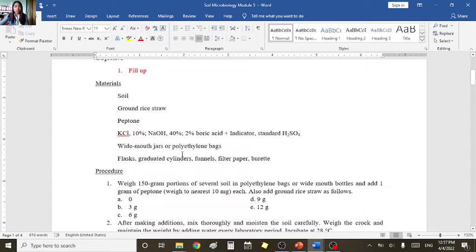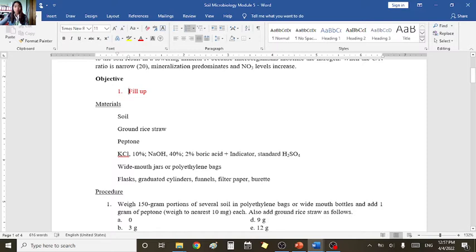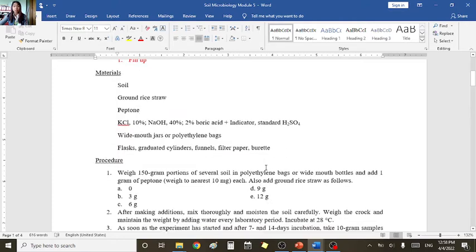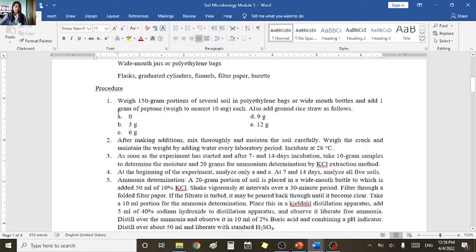Okay, I will be grading you with the objective, so fill it up. And then for the materials, just read. We have soil, ground rice straw, peptone, 10% potassium chloride, 40% sodium hydroxide, 2% boric acid, an indicator, and a standard sulfuric acid. Wide mouth jars or polyethylene bags, flasks, graduated cylinders, funnels, filter paper, burette, and other laboratory apparatus. Now, for the procedure, I will still be reading.